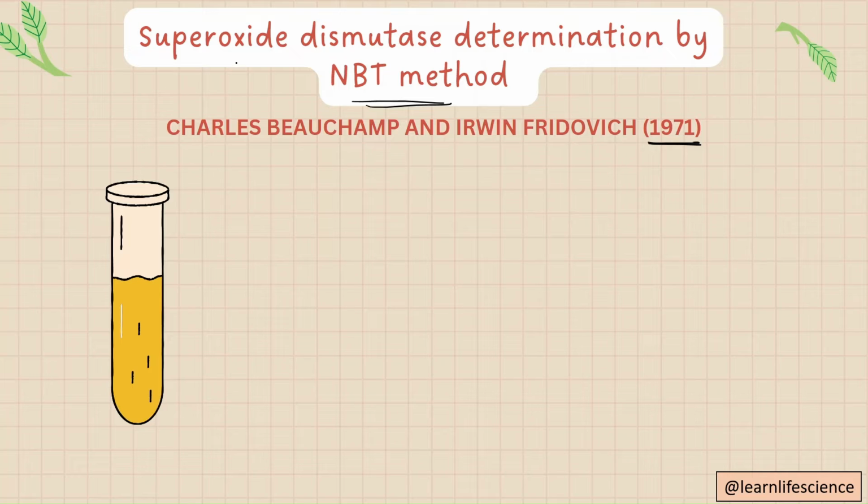If you are trying to calculate the superoxide dismutase activity in plants, it means you are providing the plant with different conditions. For example, you are studying the response given by the plant under stress condition, which I have previously mentioned.